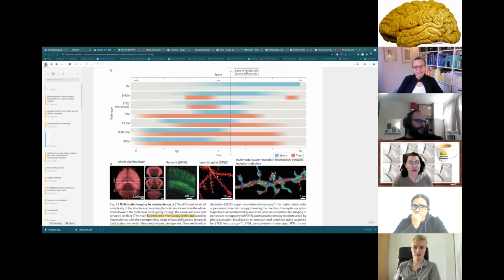It is absolutely exciting, yes. There's more and more data available from people who were imaged before and after. But obviously, yes, it does come with its own limitations. But also maybe we don't need to go from diffusion to synaptic receptor complexity in one go. We might just take one step in the middle, which, for example, with polarized light imaging and those kinds of methods, we might just take it step by step and make it happen to maybe meet in the middle, for example.